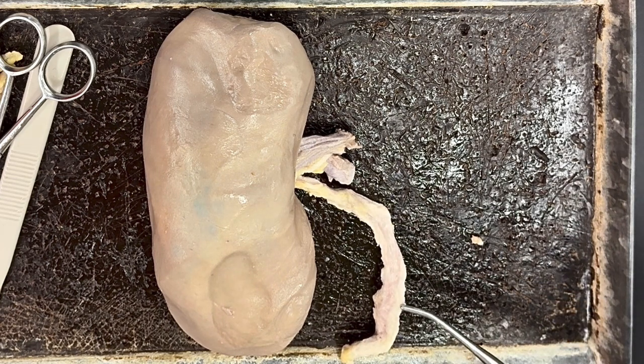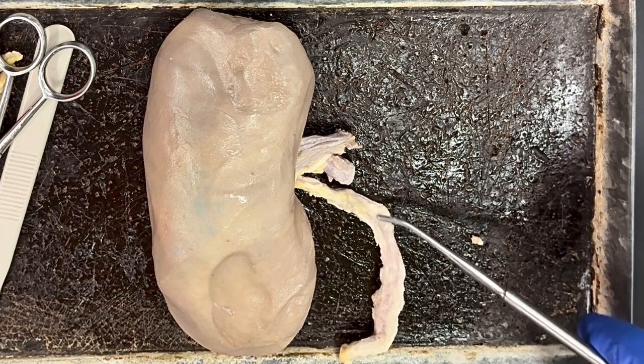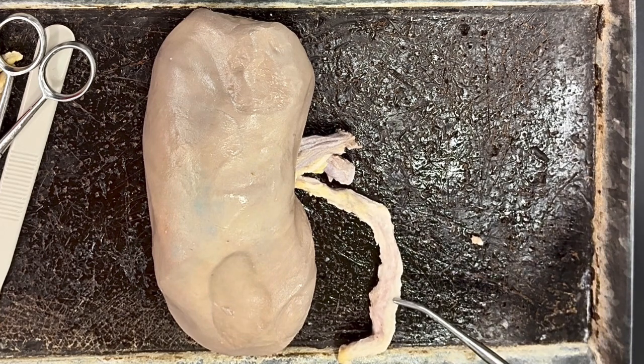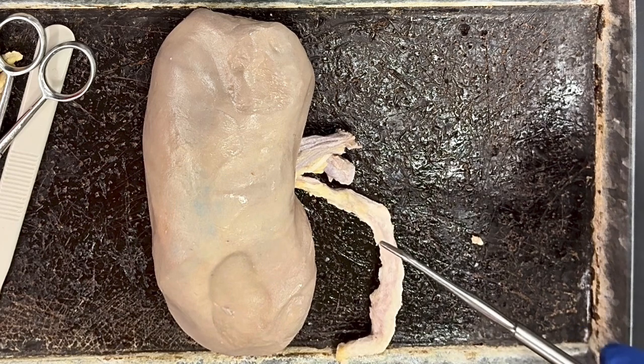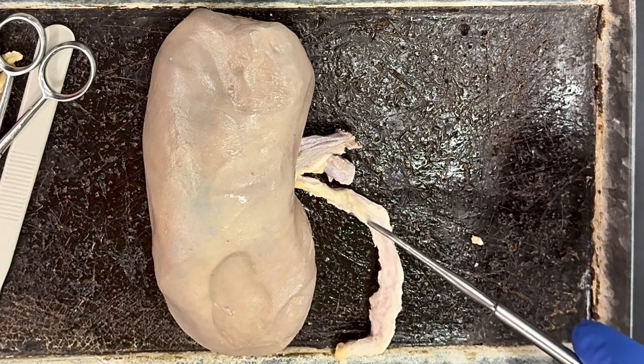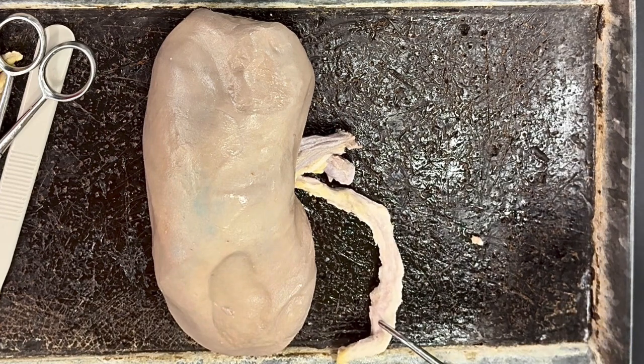There's still a fair amount of connective tissue surrounding the ureter. I cleaned a lot of it off just so that we could see it a little bit better, but there is still a little bit of connective tissue that we can see. This though is going to be the ureter, and this is what will drain urine from the kidney down to the urinary bladder.